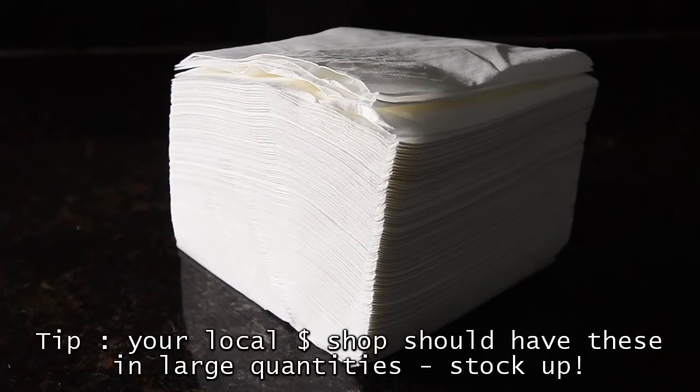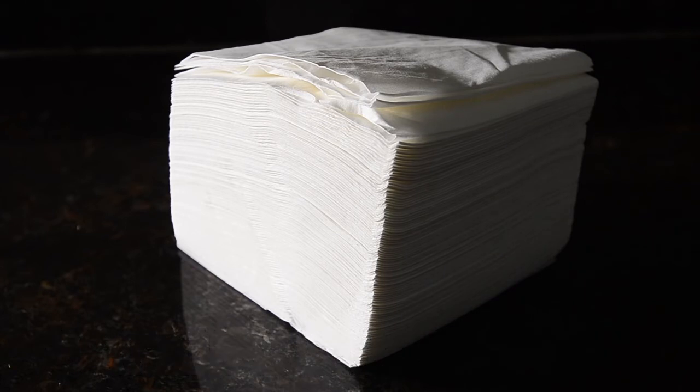And very importantly, get yourself a large stack of paper towels. Just go to the dollar shop and buy a big bag of the cheapest, nastiest ones you can find — this is a lab, not first class.